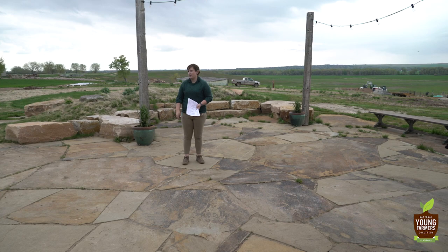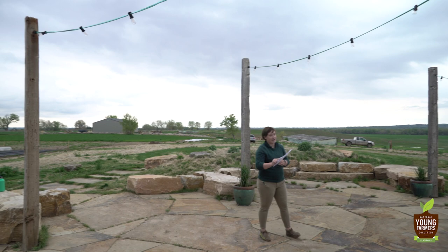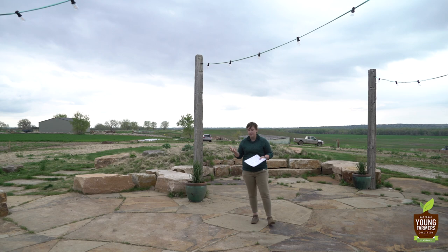So the next test is one of our kind of new cutting edge science stuff. It is the PLFA test, so phospholipid fatty acids. This test is also offered by Ward Labs, along with the Missouri State. They have a soil health testing center. It's pretty cool. I got to go down there and see it a few years ago. It's a really nice lab setup.